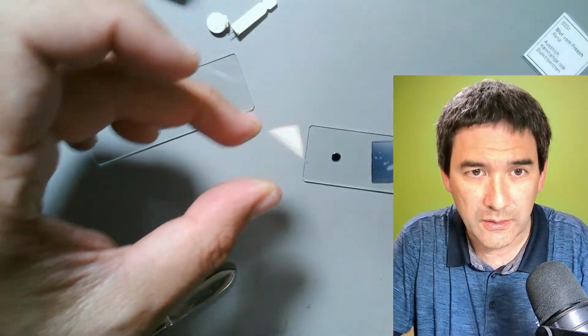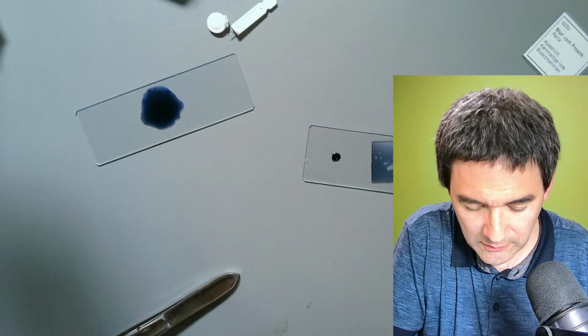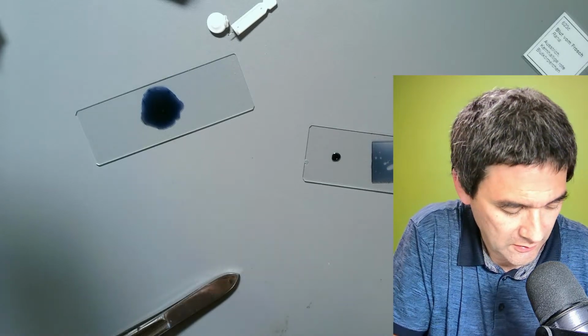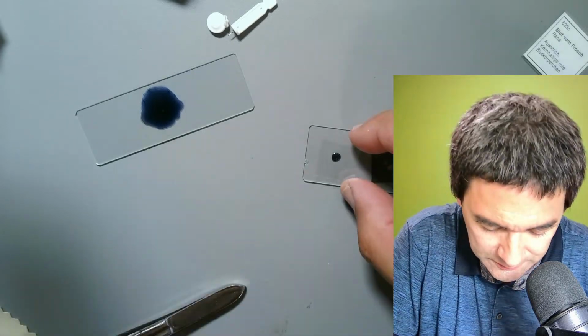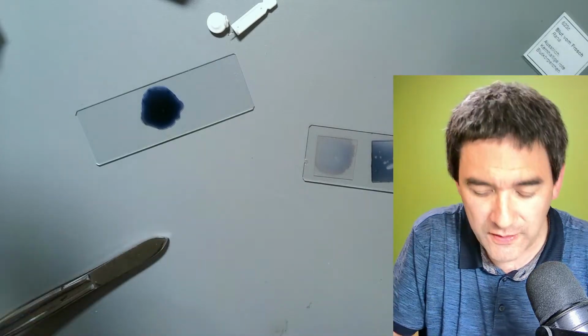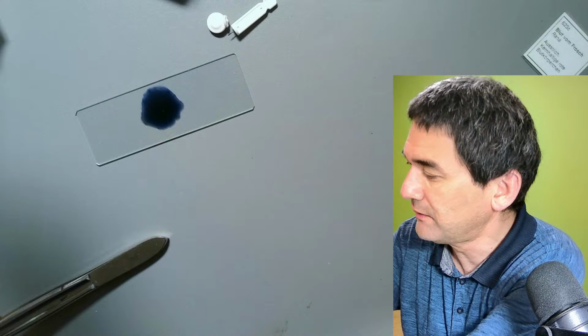This one is better. Let's wipe it again. So maybe this is going to work a little bit better. I hope that I'm getting a very thin layer, and let's give it another try.